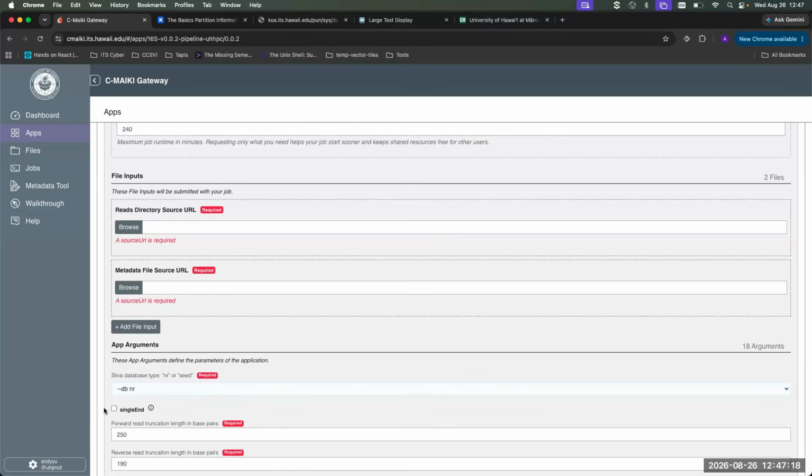So the 16S and ITS might be a question for you, Craig. Are these only the primers that people usually use for the microbiome stuff? Or can I upload my own primer sets with a different target region? The short answer is yes, but you need to be a little bit more fluent in using the server.